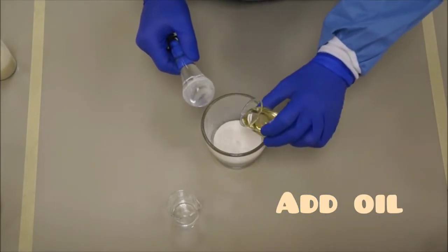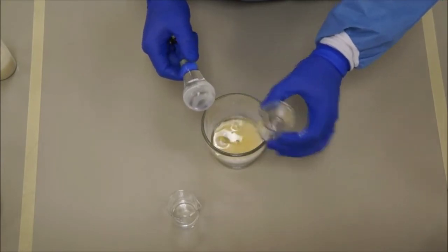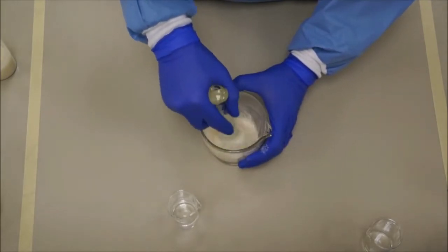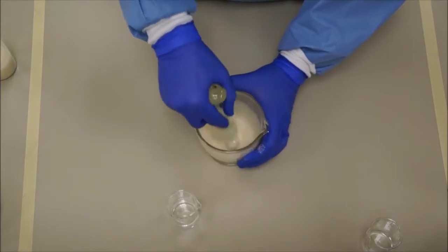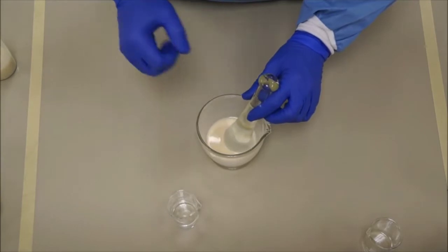Your next step is to triturate this oil with acacia. Keep triturating vigorously and continuously so that no lumps remain. It's hard, but it's not impossible.